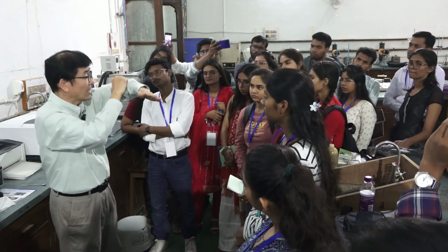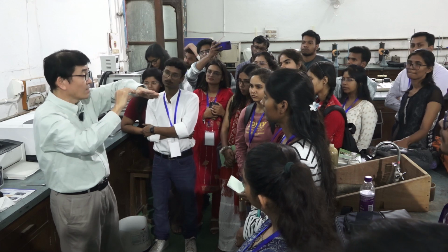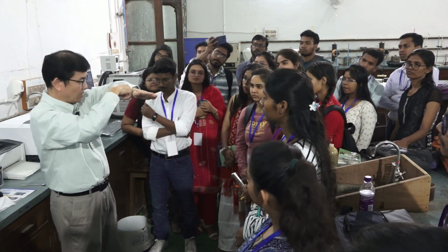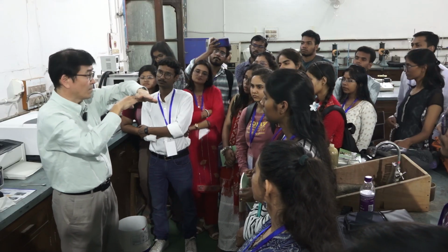It does not propagate, so it stays on the surface. In that sense it's different from this IR beam, but it has an energy of the IR beam.